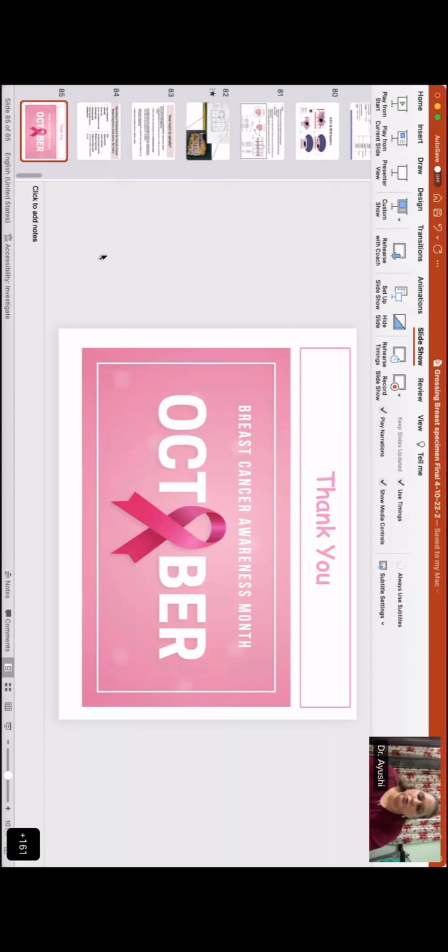that is what I'm saying, the decision is of the surgeon. So whatever the distance, if it is within 5 millimeter, you should try to report, so that it conveys the impression that yes, it is possible that there is DCIS left behind in the breast, and this factor is actually well known to the oncologist surgeons when they are doing a breast conservation surgery. So presence of DCIS near the margins, they are aware that yes, it is possible that there is presence of DCIS left behind in the breast, and then they go for adjuvant therapy if required, or revision of the margin if they feel that that will be more beneficial to the patient.